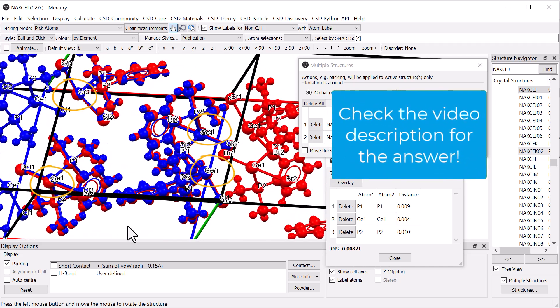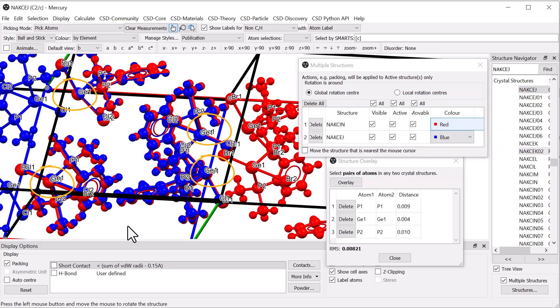To summarise, we have seen how the Structure Overlay tool in Mercury can be used to compare related molecules and structures, and how to effectively visualise, manipulate and save the overlaid structures.